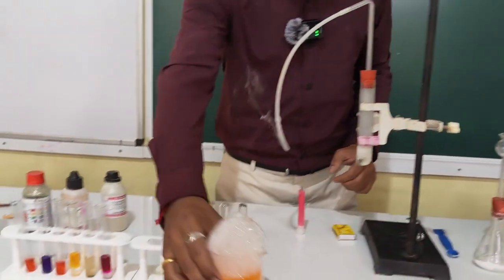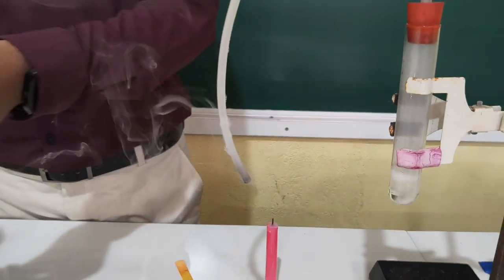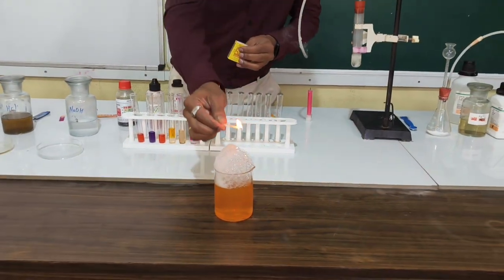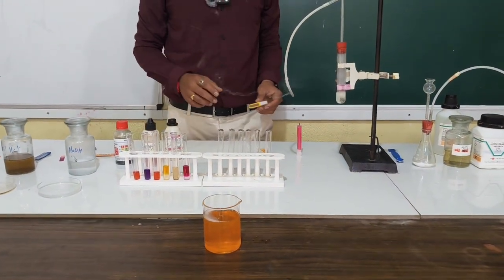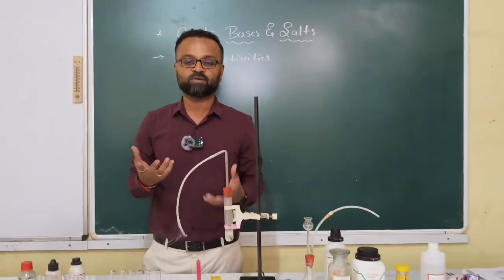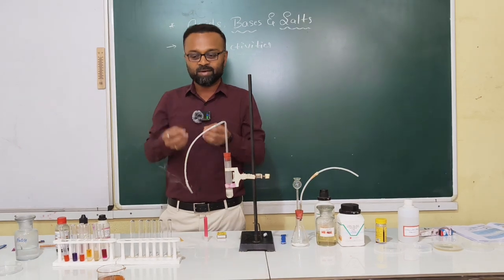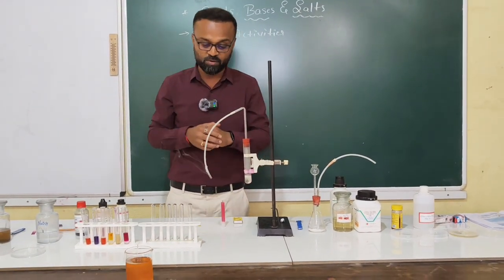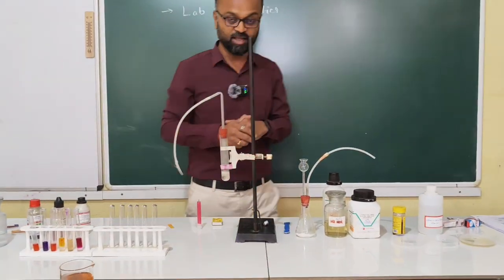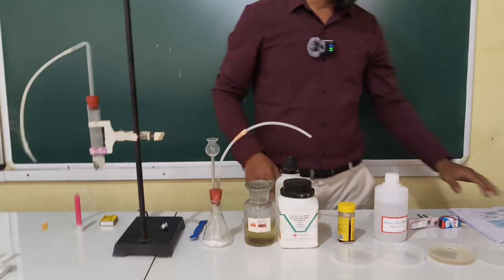So I am keeping it in front and I am trying to hold the fire to the soap solution. You can see the pop sound, clear pop sound. Why does it give the pop sound? Because hydrogen is a fuel. If a larger amount of hydrogen fuel was there, it would have blasted, but fewer molecules of hydrogen gas will produce a pop sound. We do not use hydrogen gas for domestic purposes as it is highly volatile in nature. Hope this is clear.